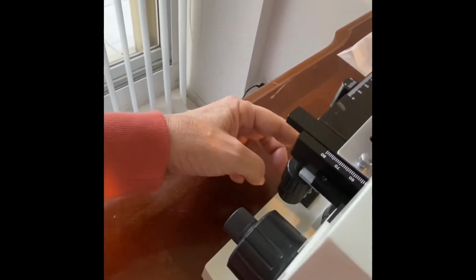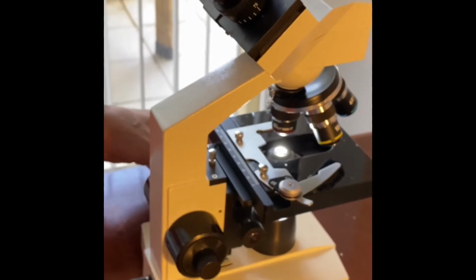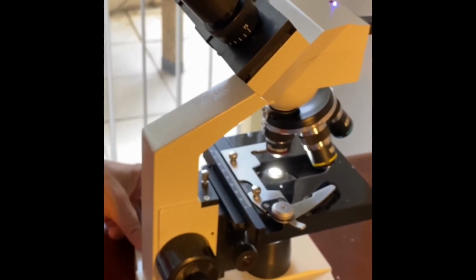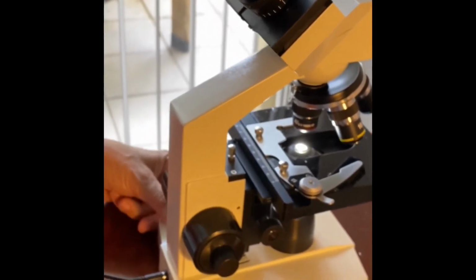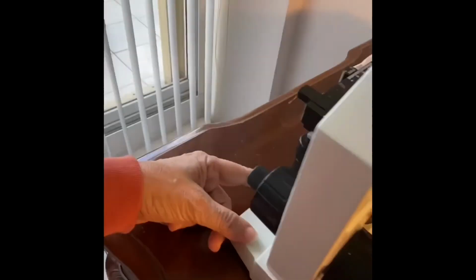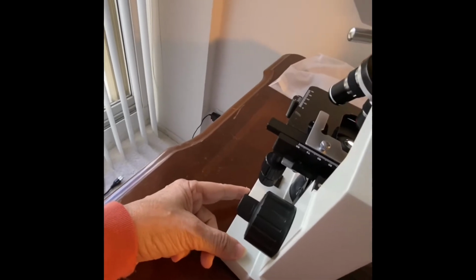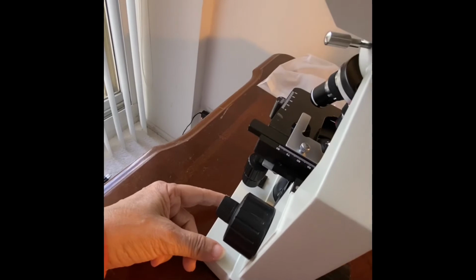Your switch may be in front of the base or somewhere on the base, not necessarily to the side. And there's also a feature on the side which allows the light to vary in intensity.